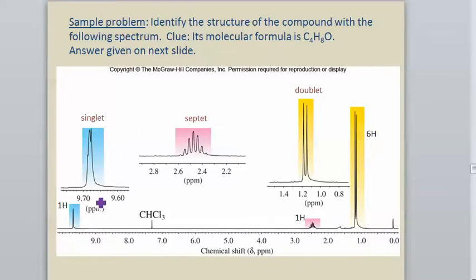First thing I notice is that this thing has a single hydrogen resonating way above 9.0. That's consistent with this being an aldehyde. So for one of those 4 carbons, we could just draw what would be an aldehyde group, and that particular hydrogen should give a singlet with that kind of resonance. Notice this singlet has a little bit of splitting going on, but labeling it as singlet means we shouldn't expect that that's going to correspond to any type of splitting that we can make sense of.